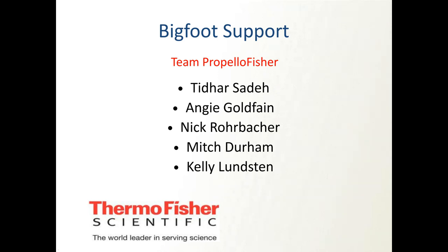I think a panel optimized for the Aurora is not going to be optimal for the Bigfoot, and vice versa. So right now, one of our current quests is to come up with maybe 15 colors that are going to work great on both. And that's what we're moving towards now. The 12 color panel we have that I'm looking at from the Teton Lab looks like it might meet that. And we're seeing some subtle differences in the unmixing, and that's what we're working on right now.